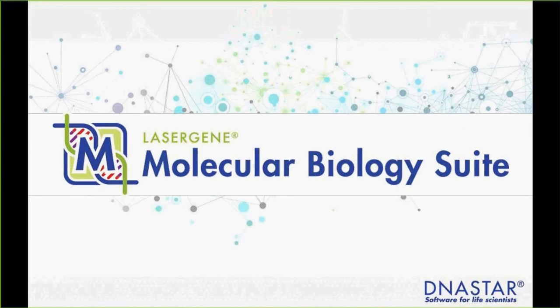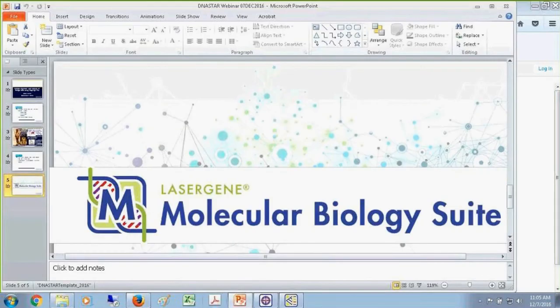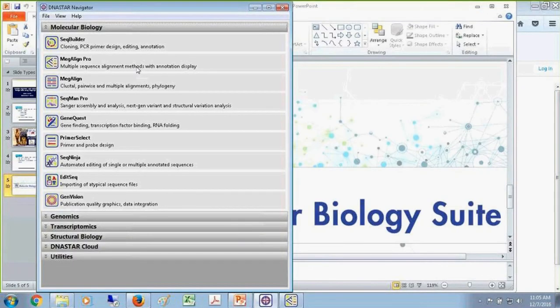All right, so moving into our molecular biology suite. So here I'm going to transition to Megaline Pro itself. I'm going to start with the DNASTAR Navigator. This is an interface that's included with the Lasergene software. It's a great resource for accessing all the applications without having to root through files. Here there's the categories, molecular biology, and we also have additional categories below, which aren't the focus of today's talk. So I'm going to move to the Megaline Pro tab right here.